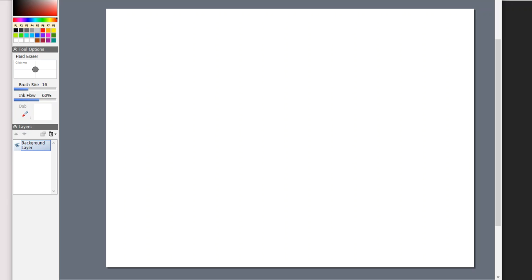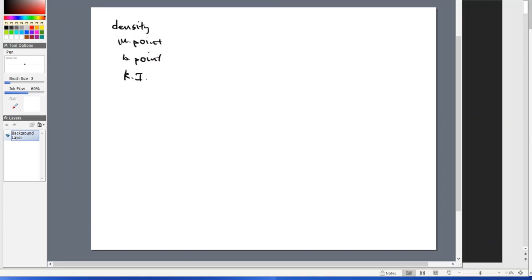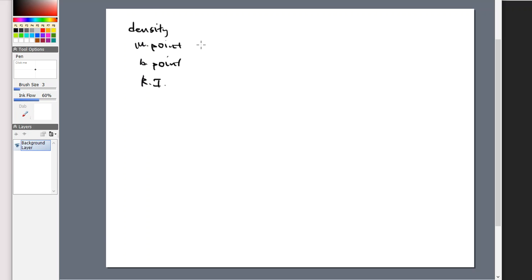Basically, you have done things like density, melting point, boiling points, and refractive index on these compounds that we have provided you in a lab. All of these, if you were working in a wet laboratory environment, would be used to help ID your compound.